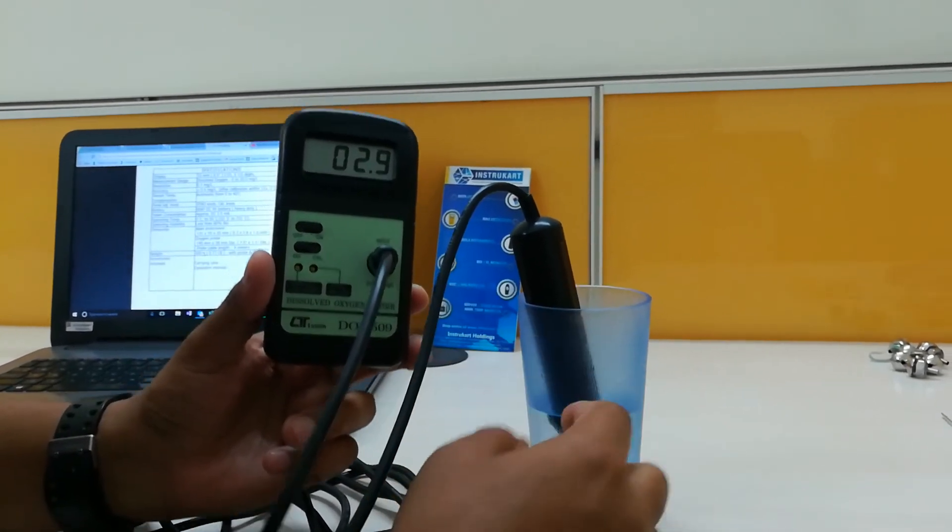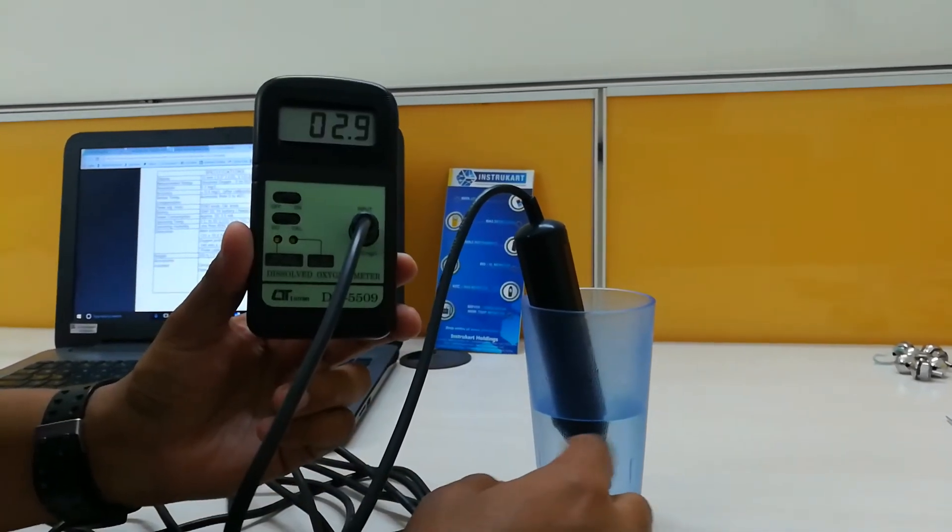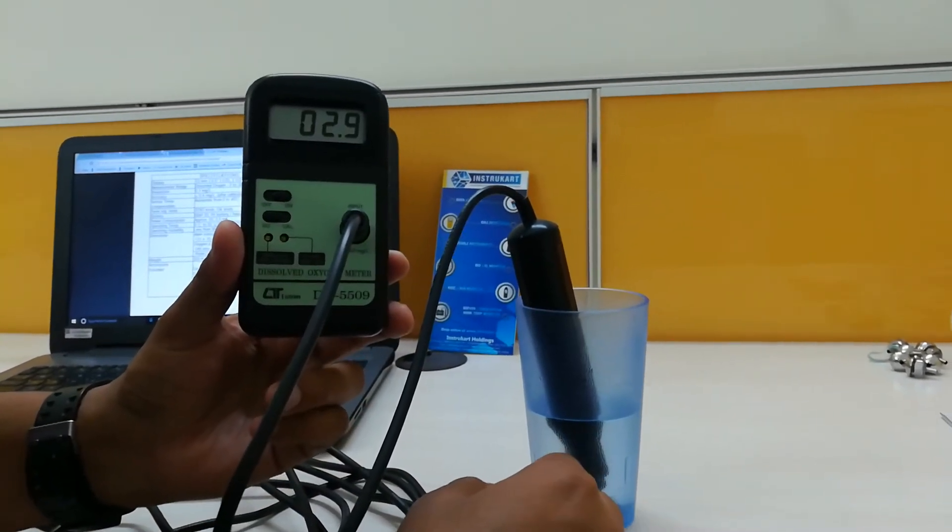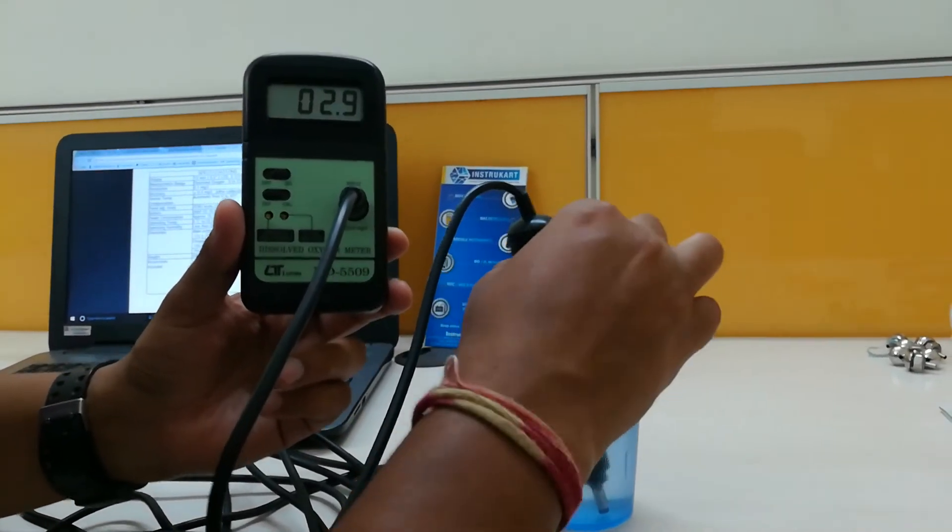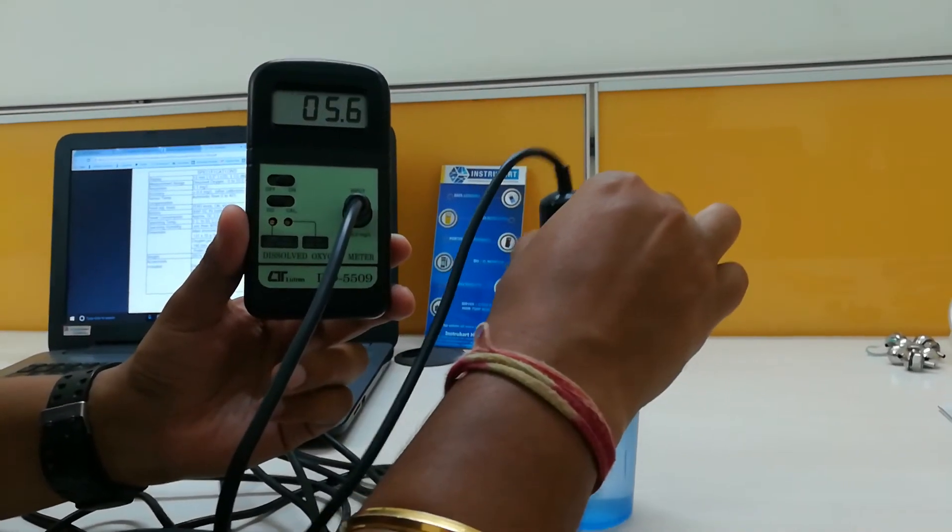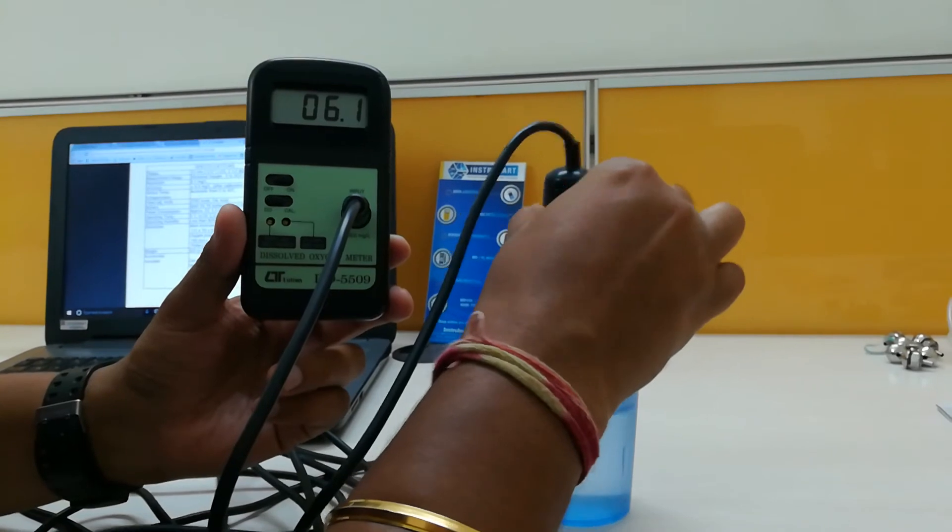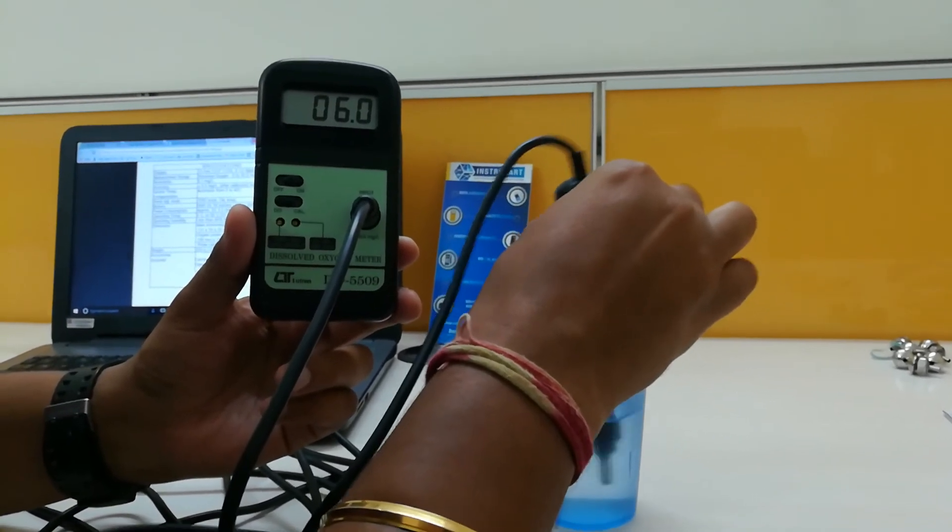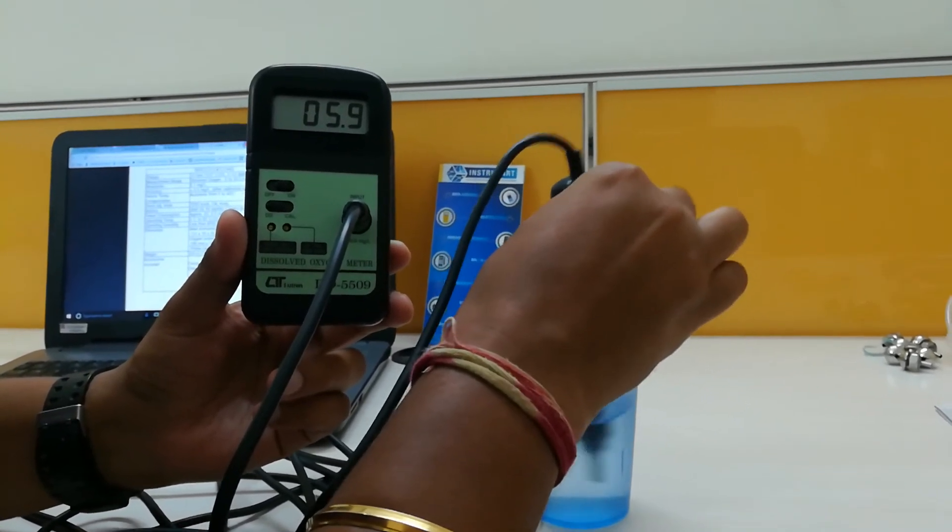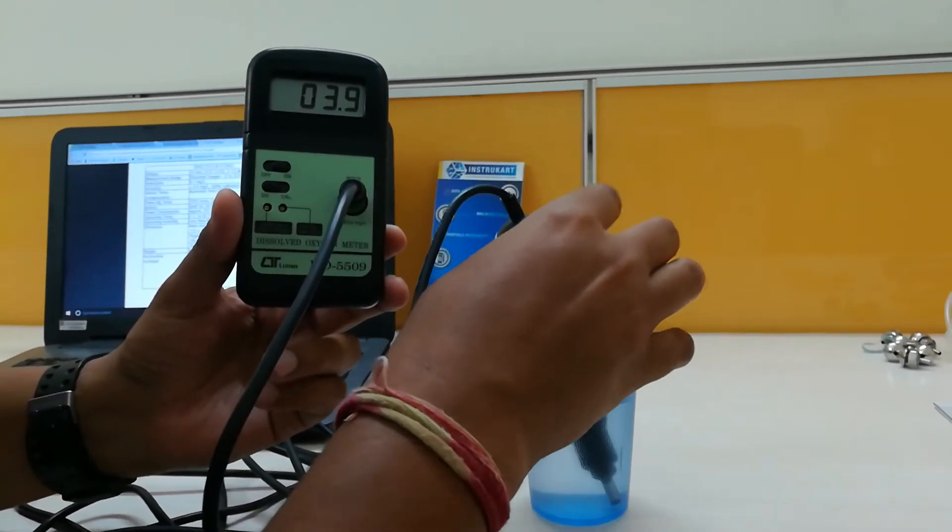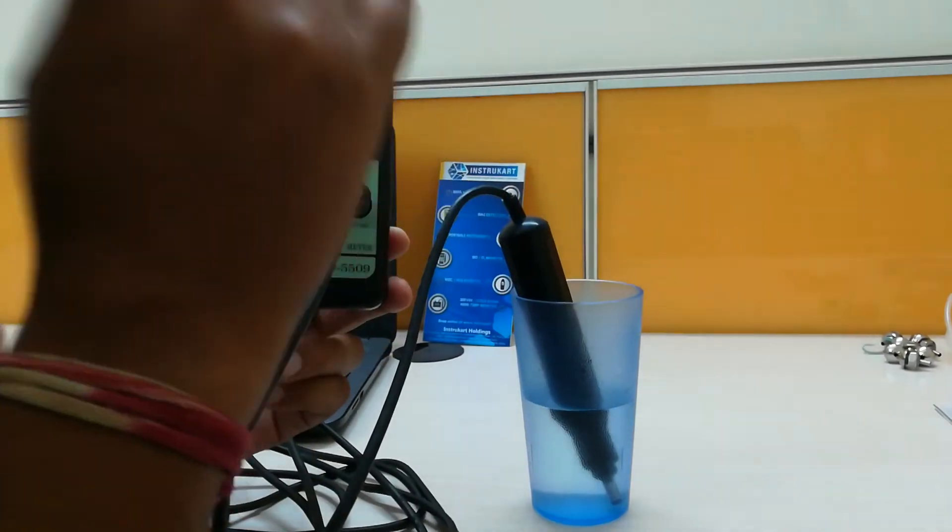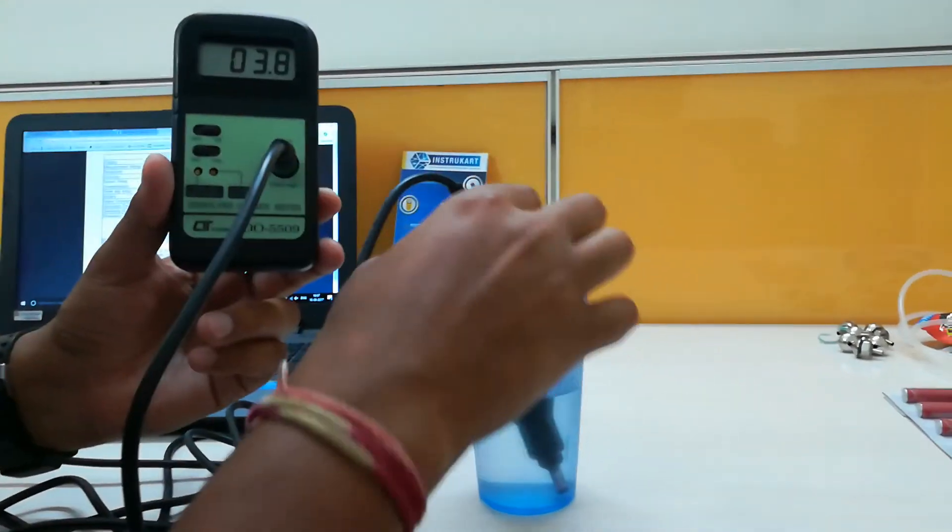So if I try to add some more oxygen in this, it will increase. We will simulate the same thing by shaking the probe, and we can see the increase of dissolved oxygen in that water.